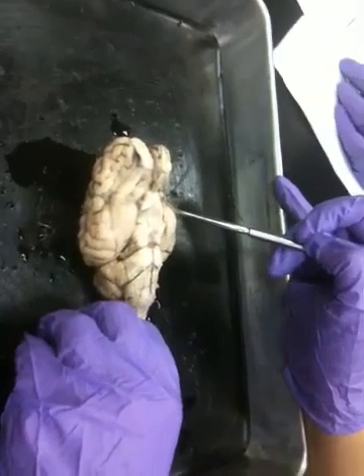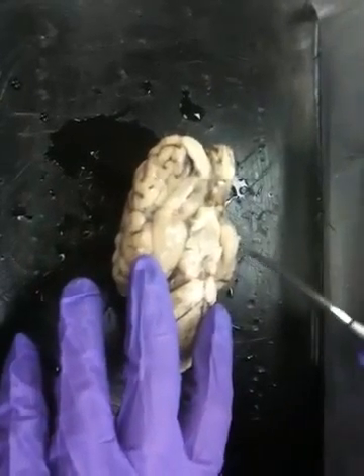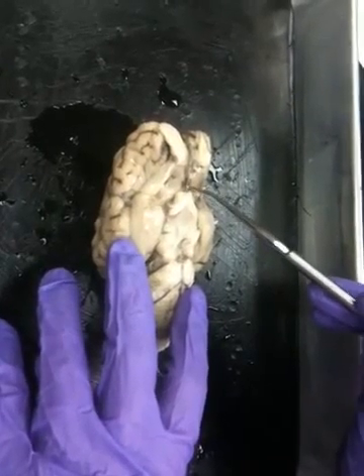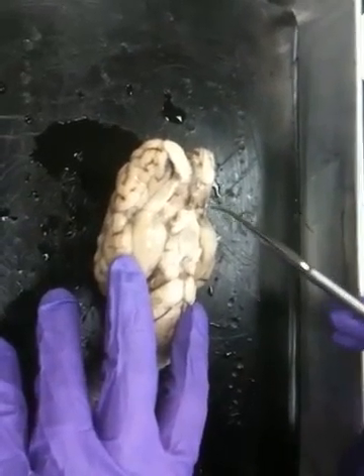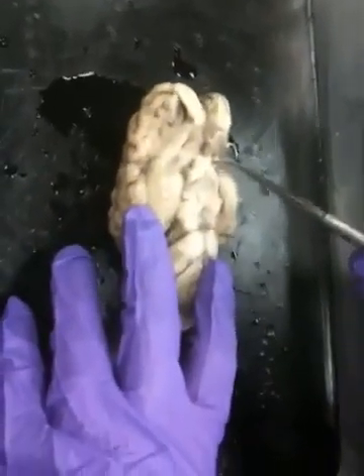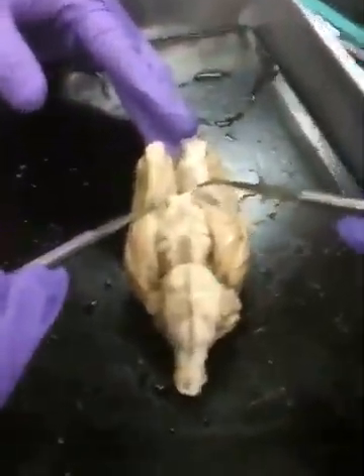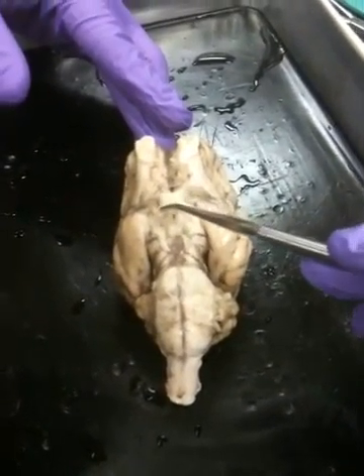Okay. Longitudinal fissure. Oh, we gotta flip them back over. Longitudinal fissure. Optic tracts. Okay, so then we get the cheap brains, so we don't really have good optic nerve, but you would want to realize that it would come off here into the little eyeball and here to the little eyeball. An optic chiasm. The optic chiasm is the cross, and it's even clearer on the sheep. So you can see all this section in here. You'd consider that, and then these are the two nubs of the optic nerve, where this is the tract. And on here, here's the tract.